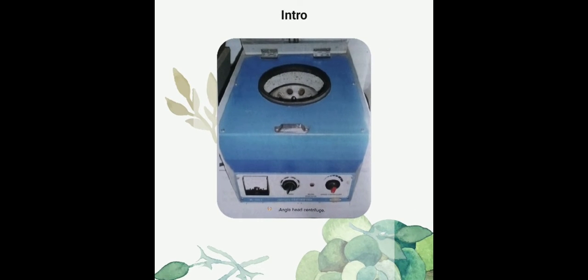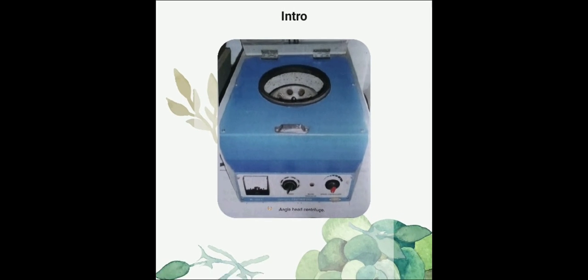In the angle head centrifuge, tubes are positioned rigidly at a fixed angle, 25 degrees to 40 degrees to the vertical axis of rotation. Due to the very low friction of air, angle head rotors attain much higher speed.